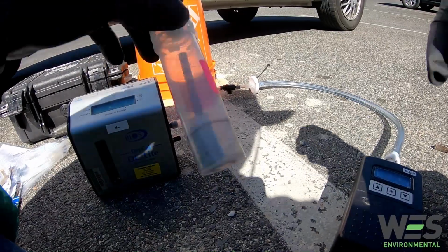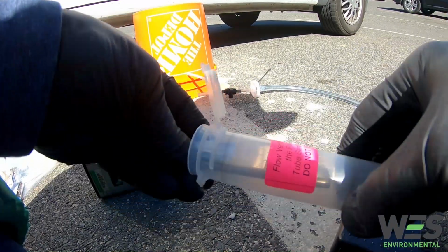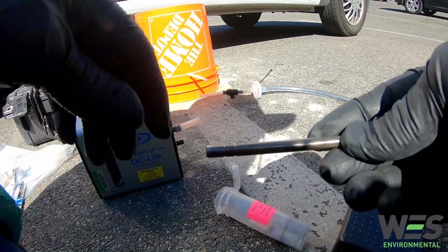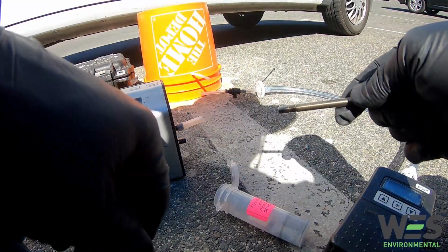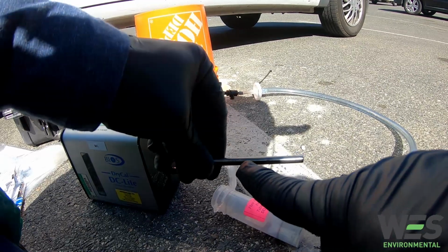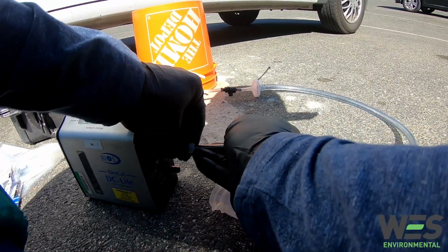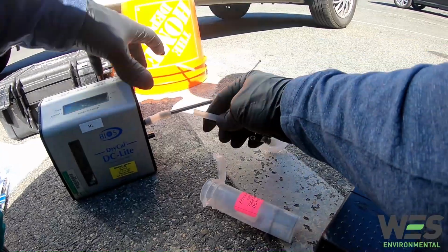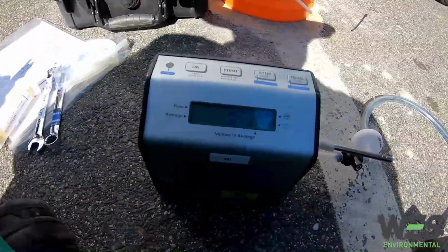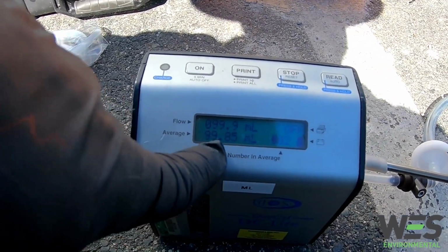So first thing we're gonna do before we hook up the sample TD tube, we're going to verify the flow. So this is like a mock TD tube. It's just made to measure correct volume we want from our true TD tube when we go to sample. Look at the arrow here. I'm not sure if you can see, but the flow has to go this way. So I'm gonna put it in here, which is the inlet. I'm gonna hook up the pump on the outlet. There we go. So we'll see what it's drawing at. And just so you know, I want this to be at 100. So it's pretty darn close, which is great.